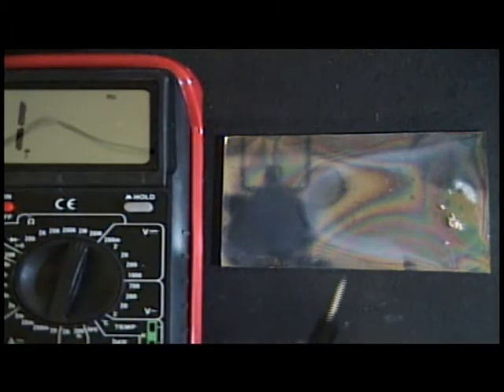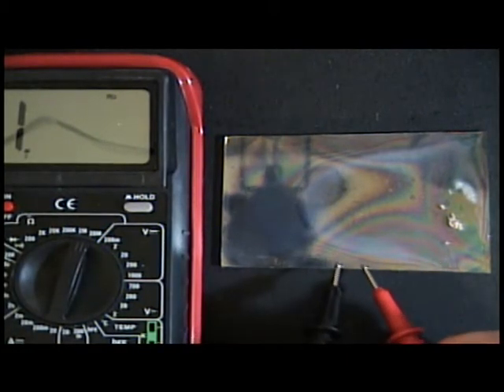Glass is perfect for contaminating — it's got sodium and all kinds of stuff in it. So if I turn on the ohm meter, I can show that we have very conductive transparent glass.